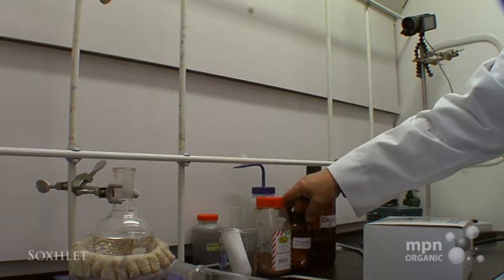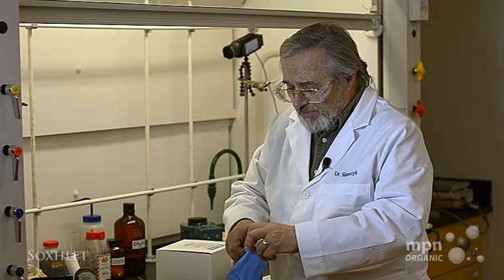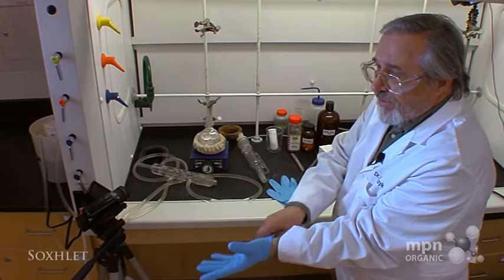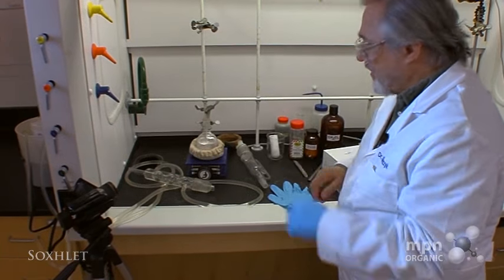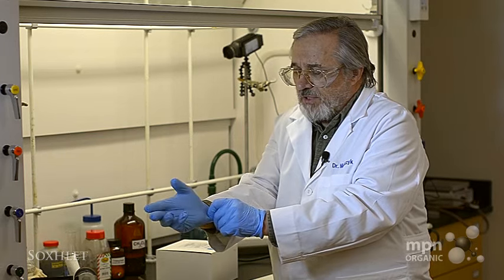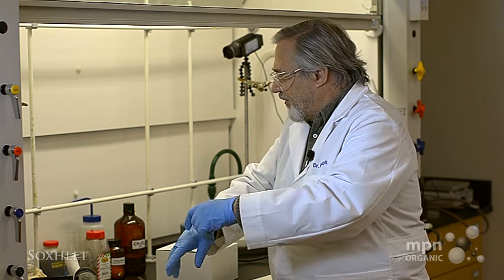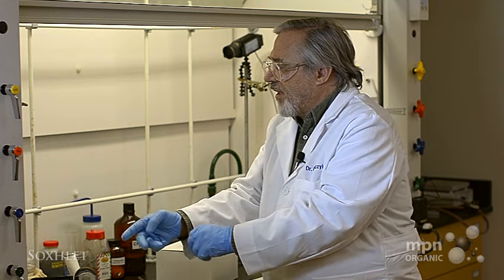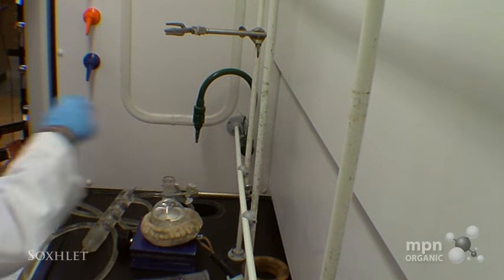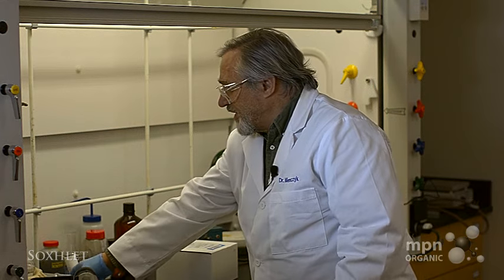The apparatus we're going to use is what we call a Soxhlet extractor, and I'll assemble that for you. Since we're dealing with methylene chloride, we've got to make sure that we use protection — we're going to use our rubber gloves. I've taken the liberty to put about 150 milliliters of methylene chloride into this round bottom flask, and I also put in a couple of boiling stones to facilitate boiling.